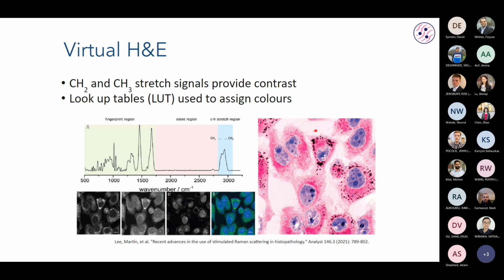It's the white spots in the image. Yeah, the white spot we understand because that's also visible with the staining image. But when we talk about the staining, we usually associate the dark color with the artifact from staining. Now we see the dark artifact here, but not exactly sure what that means in the image.